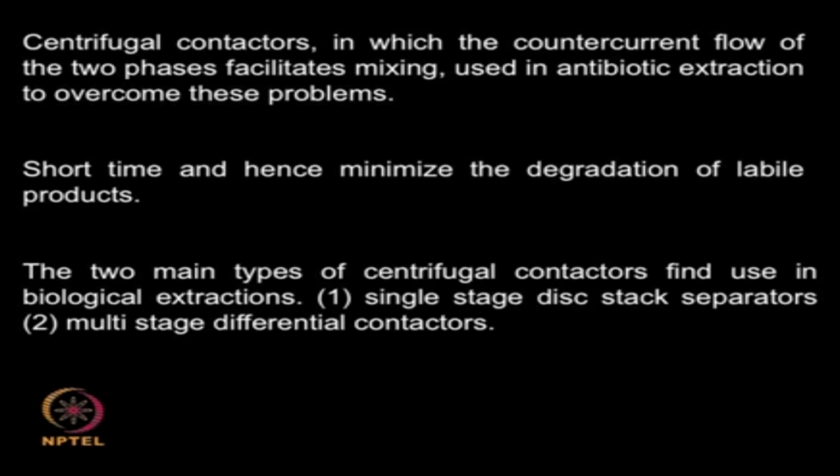That means the higher density liquid will reach the walls faster because of the centrifugal force. So, the walls will have predominantly more higher density liquid, and the lower density liquid will be more in the middle portion. So, centrifugal contactors are another way of separating out these 2 layers instead of resorting to settling based on simple gravity.